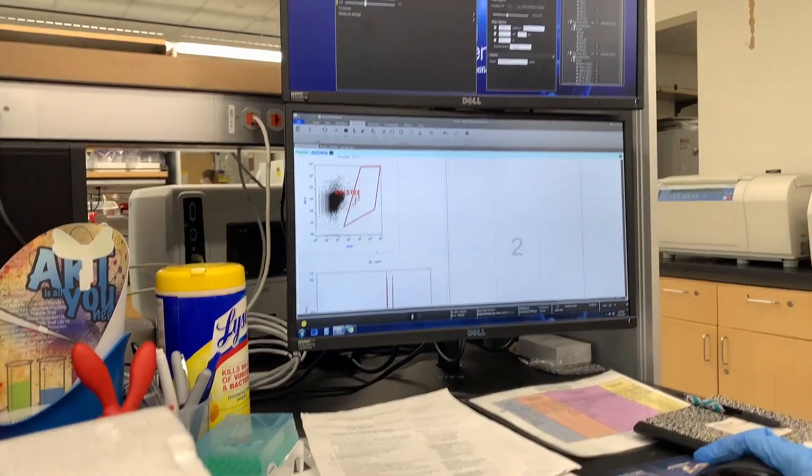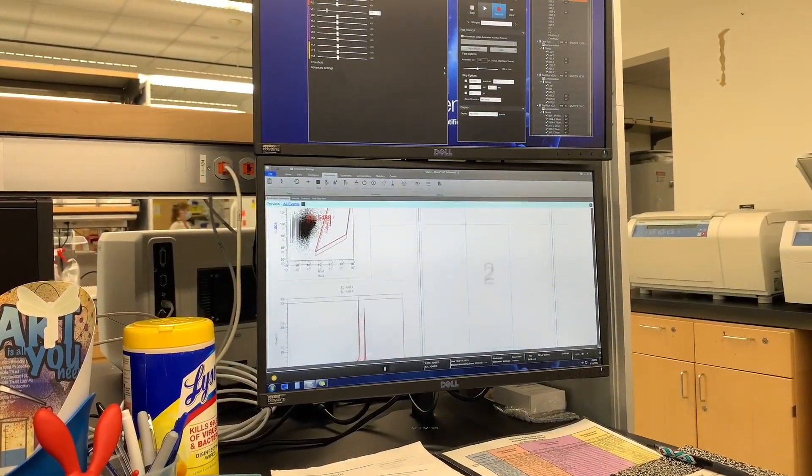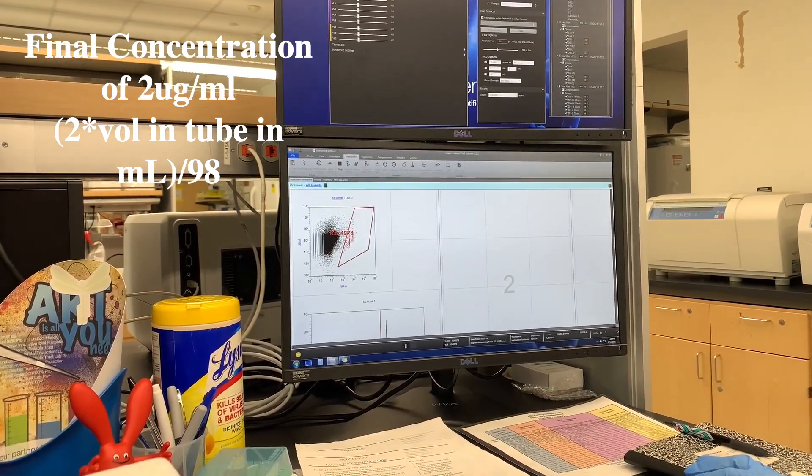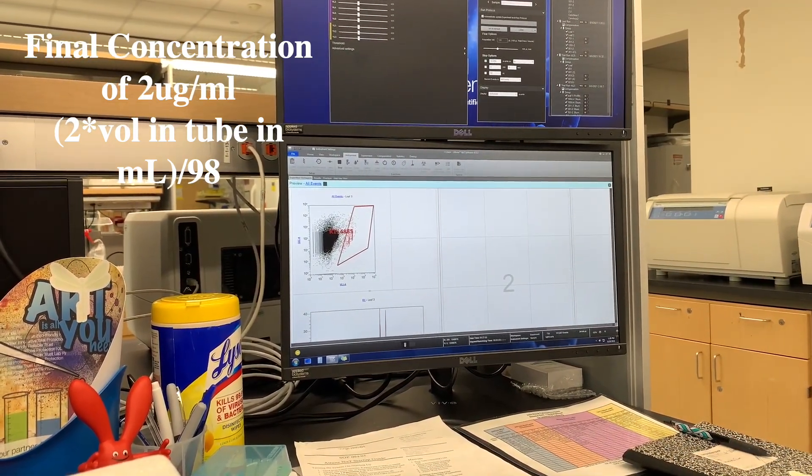Finally, we're at the last step: the flow cytometer. We're going to want a concentration of 2 micrograms per milliliter of DAPI in our solution. You'll have to calculate that with this equation.